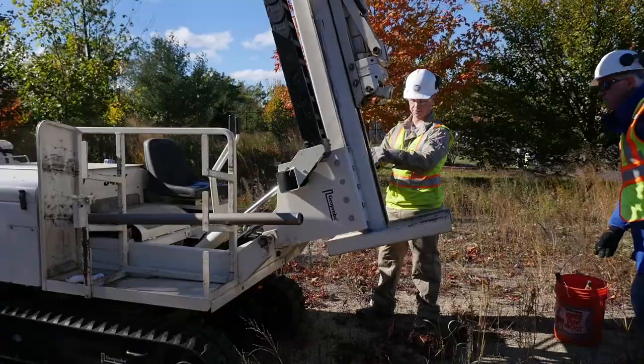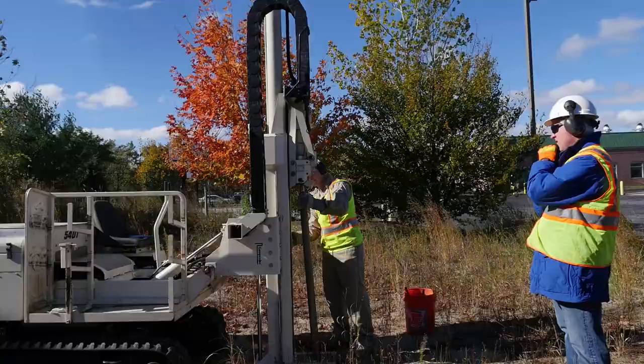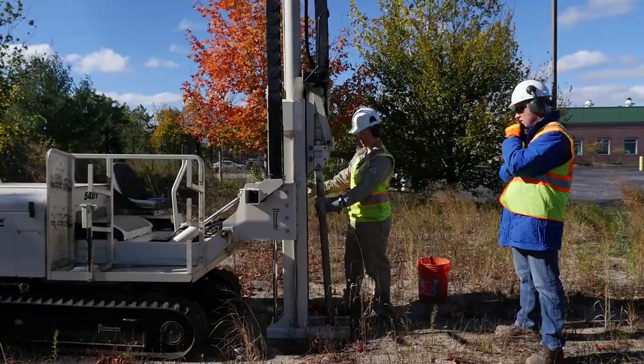The GeoPro, which is a trade name, pushes rods into the ground and we've gone up to 70 feet to put in groundwater wells to collect water samples. We've also used it to go as deep as 60 feet to collect soil samples.